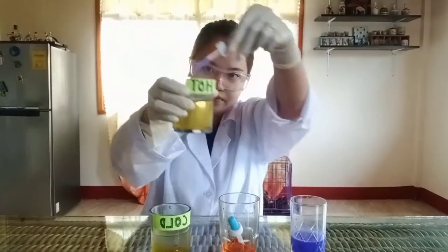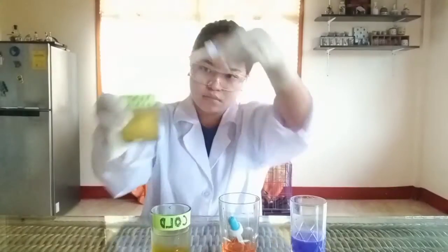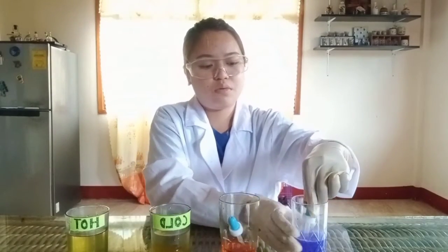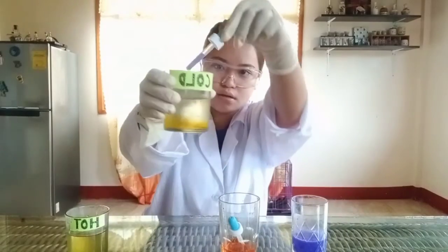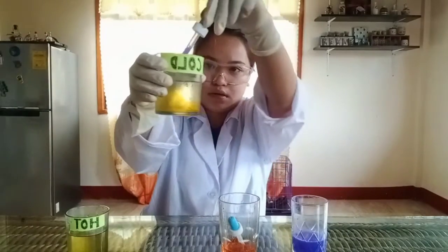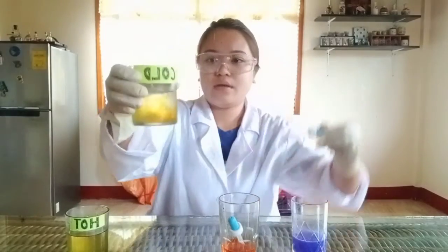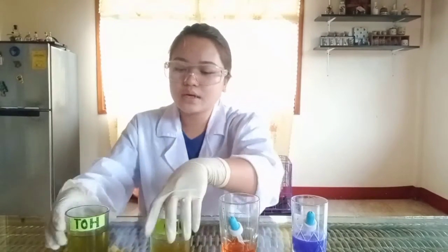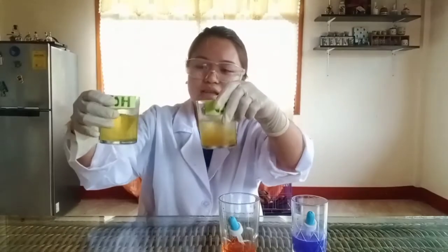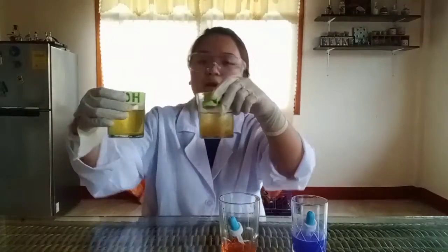Add some into our cold water. After we conduct our experiment, observe what happens and record what you have gathered in your laboratory notebook.